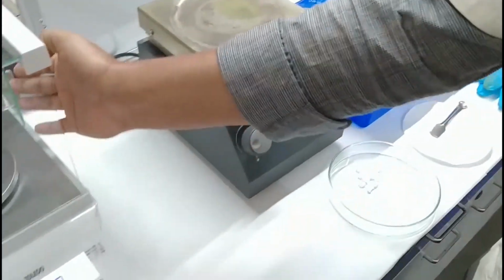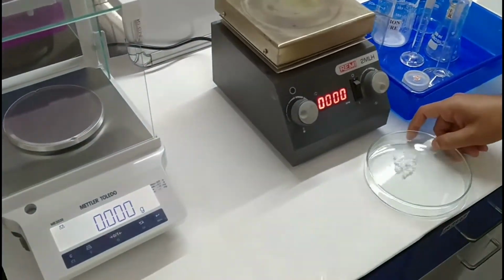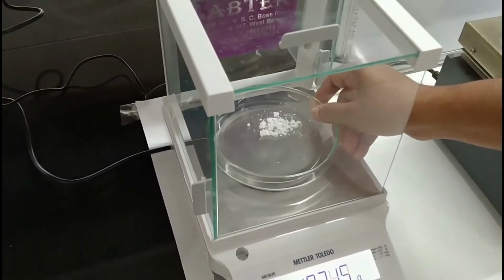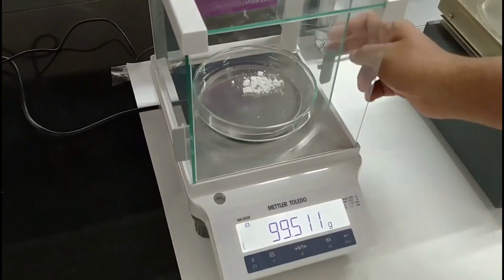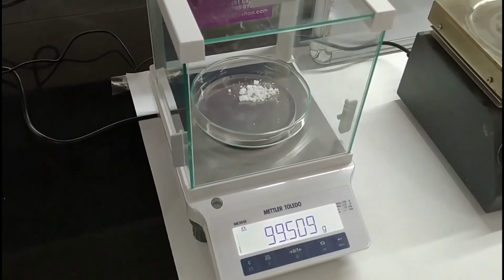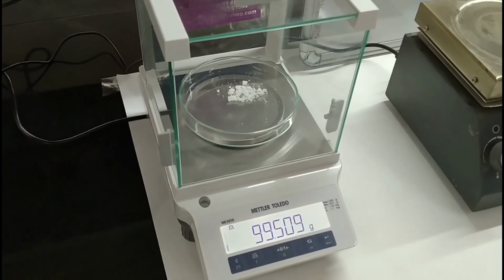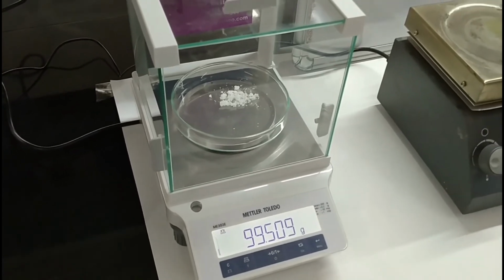Now again we are going to take the weight of this petri dish from the weighing machine. So what is the weight? 99.509 gram.